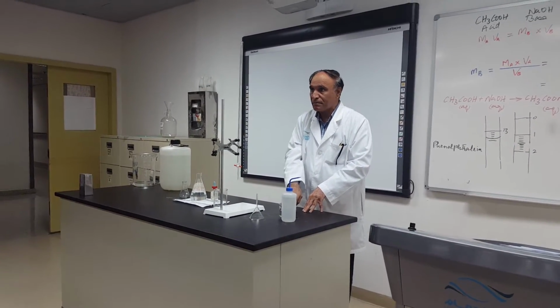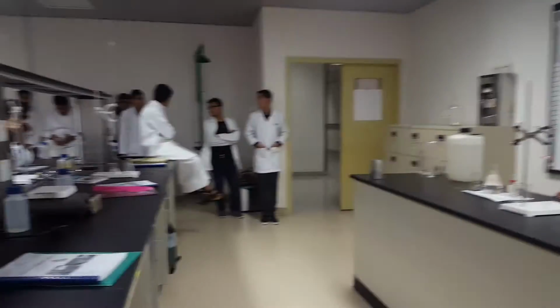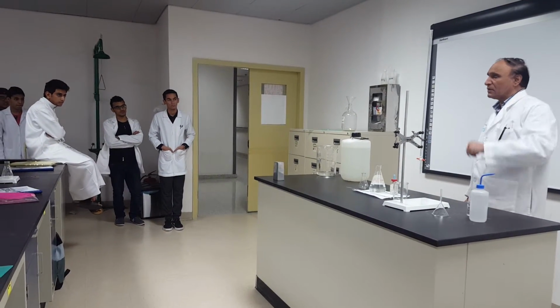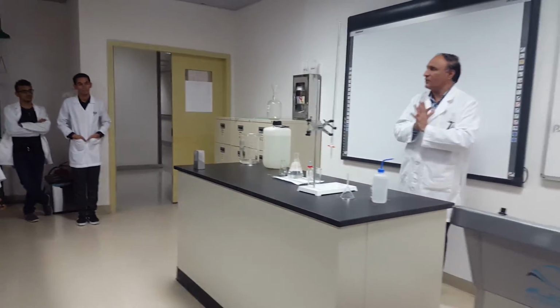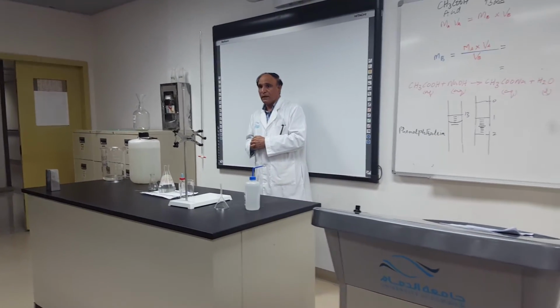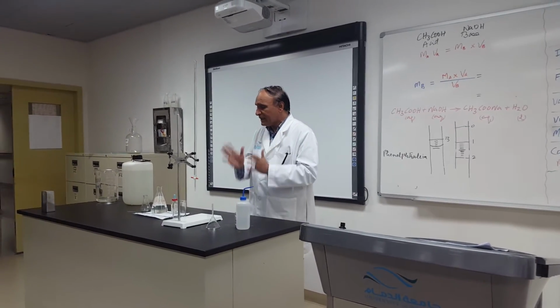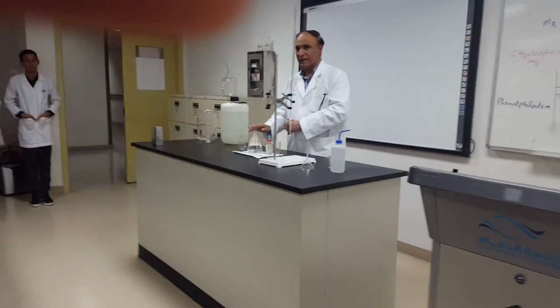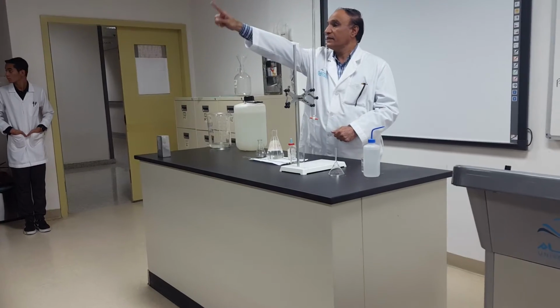Understood? Teacher, first we should wash the beaker with distilled water. It is already washed. Okay, don't wash with distilled water, because there will be some water and it will make it dilute. Bring it as such. It is already washed with distilled water, the beaker. Now, one student out of two will take the acid, vinegar. And this acid is there in 4 places. Look over here, there, that place and that place. 4 places.